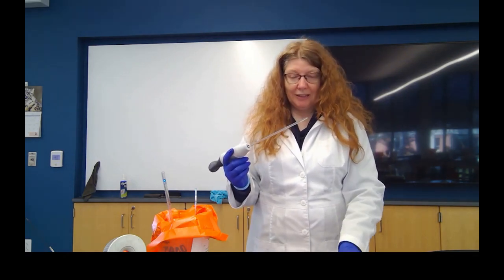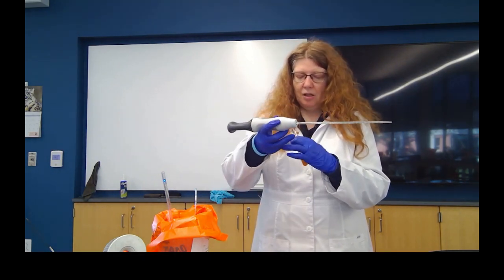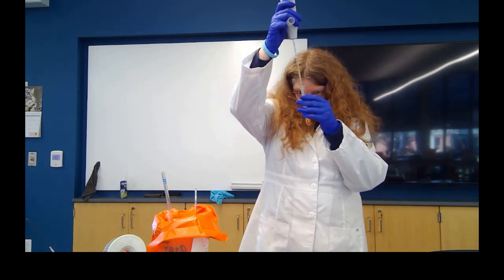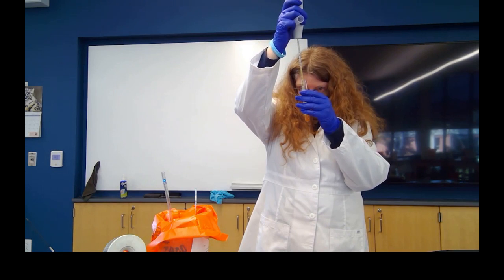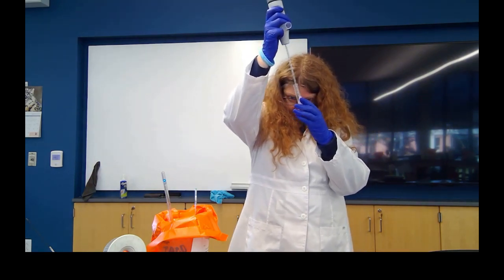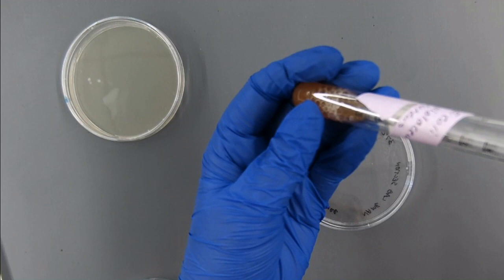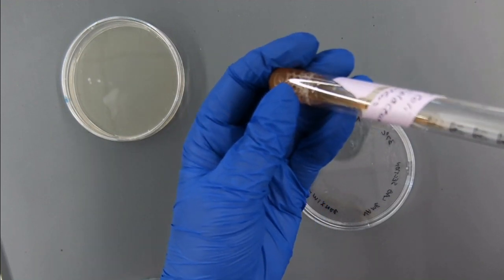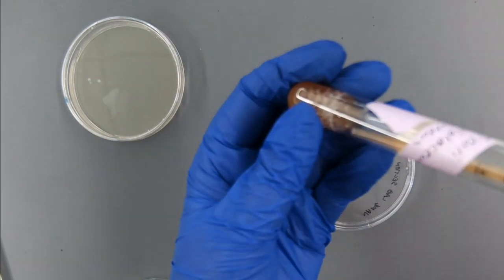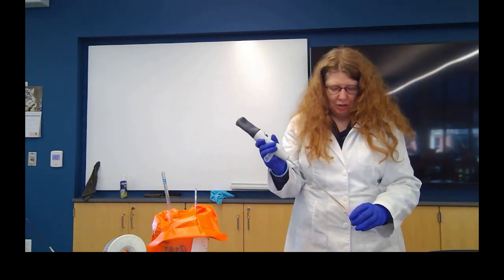Now that I have my pipette in my bulb, I'm going to take my tube of bacteria that has been mixed, and I'm going to place my pipette into the mixture, and make sure that you do this without any bubbles. If you can see, I'm going to slowly draw this up, and you can see it rising into the pipette. So now I have it at 0.6 milliliters. I want 0.1 milliliters.